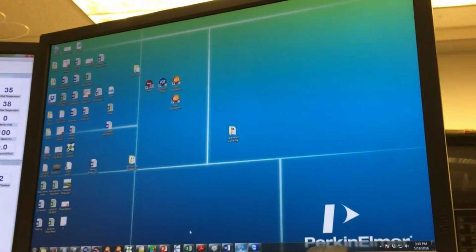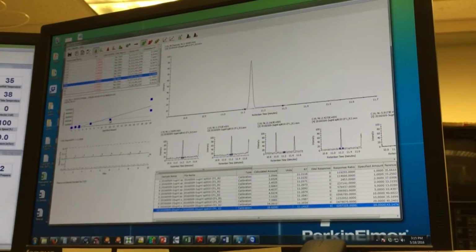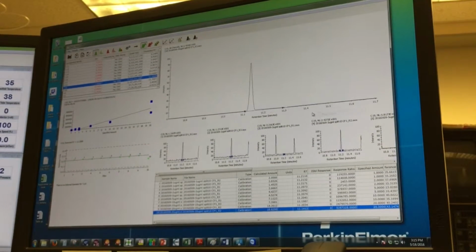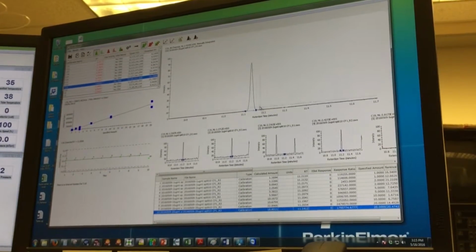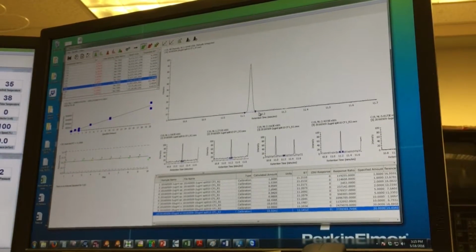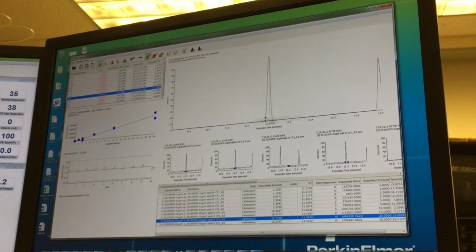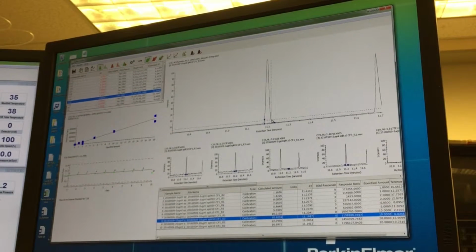So already you get the calibration curve here, but you know, this is off, this is off. You can reset, and here you can do manual integration. Like here you see it chose a very long point. Now you see it has changed. If you put it here, you see it's off. You bring more. So now here you can do manual integration. If you click here, it will change again, I think. You can reset zoom, you can also change here. You see it's 10.7, you can change here.